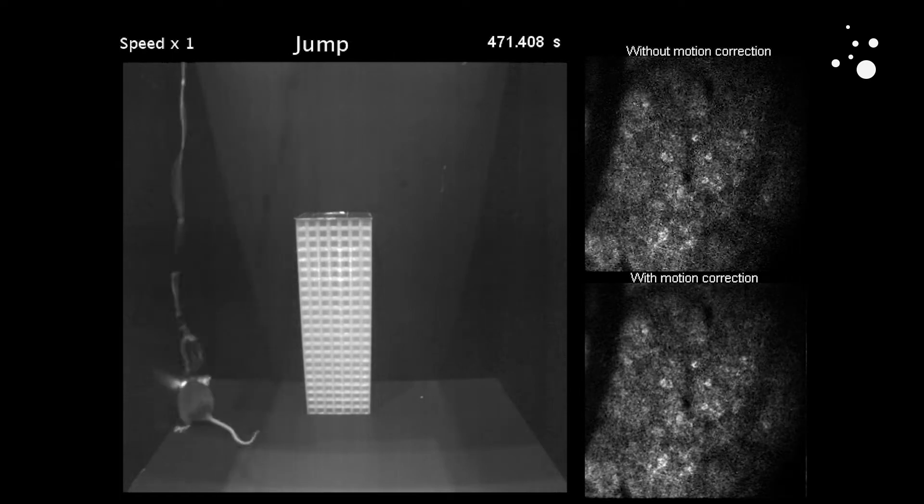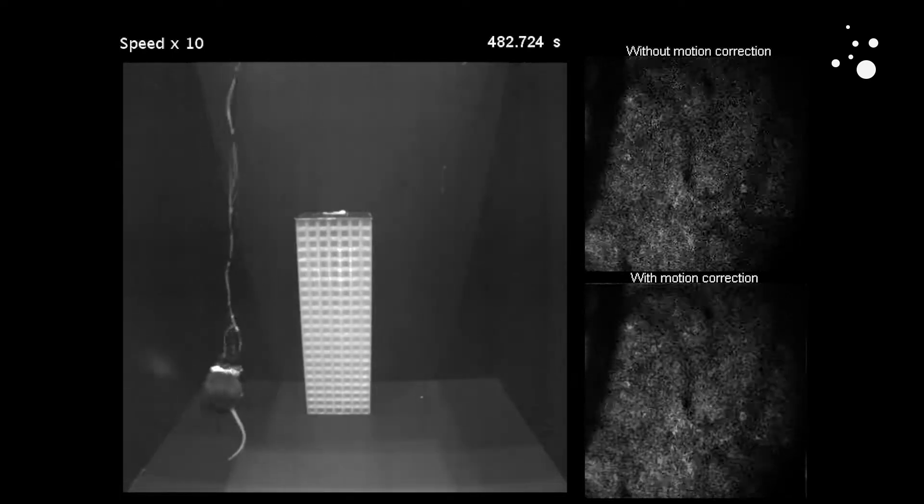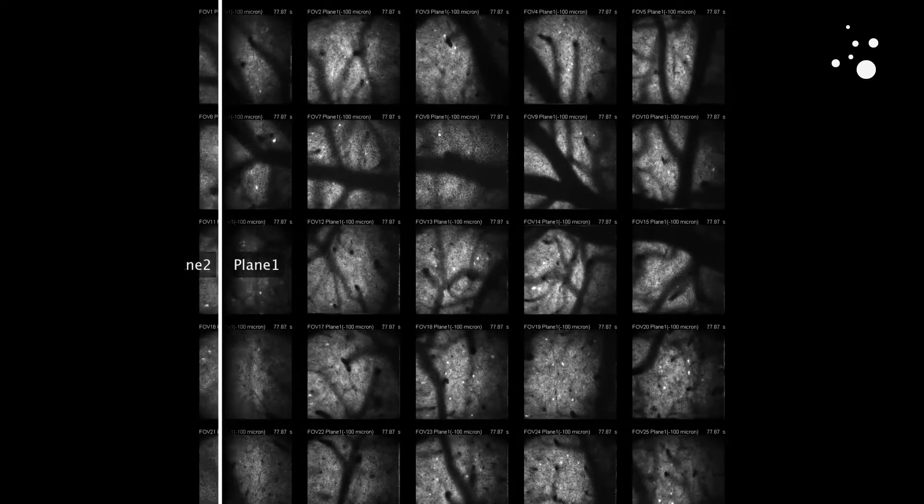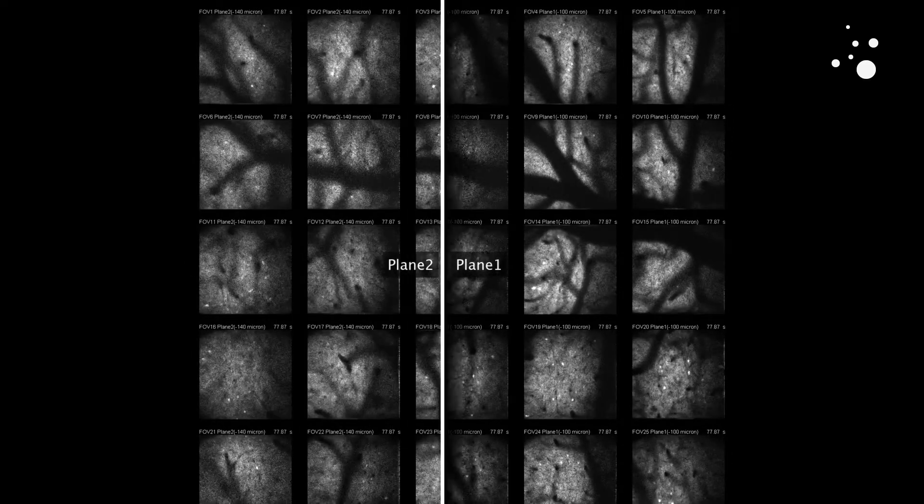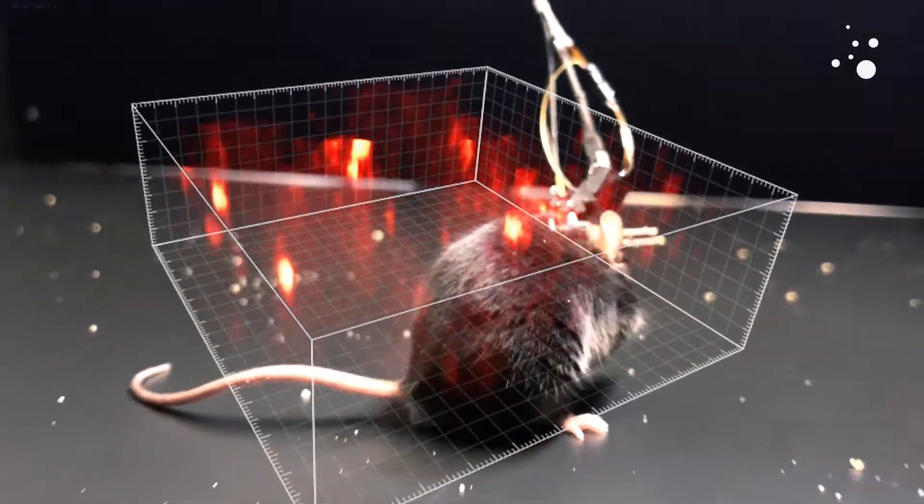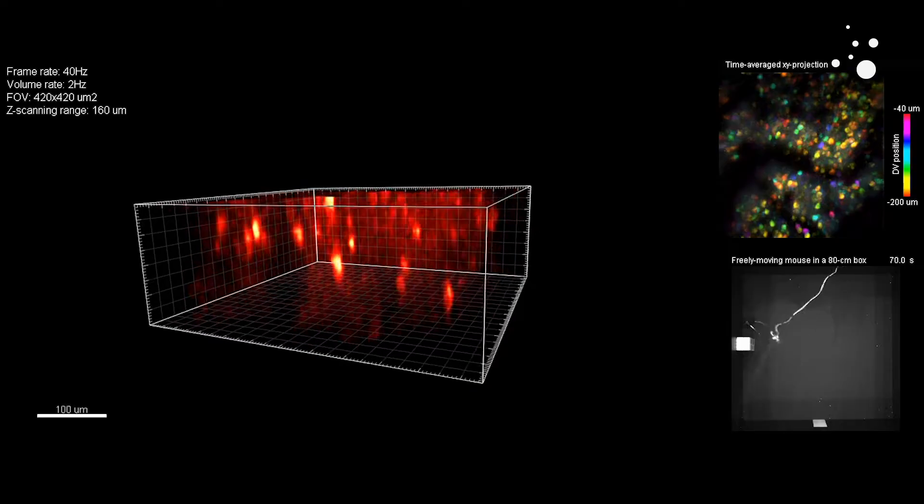Mini2P records simultaneously from thousands of brain cells. By using a kind of patchwork quilt technique, it can map even larger landscapes, like these 10,000 brain cells across the visual cortex. The microscope also covers the z-axis and can record 3D volumes of brain tissue.